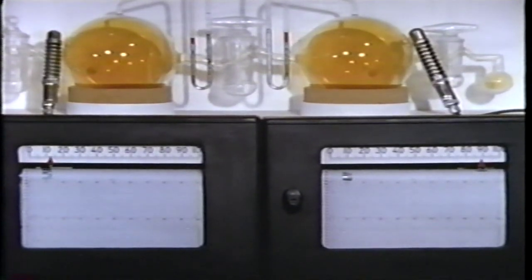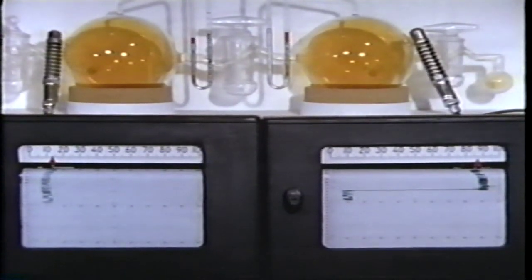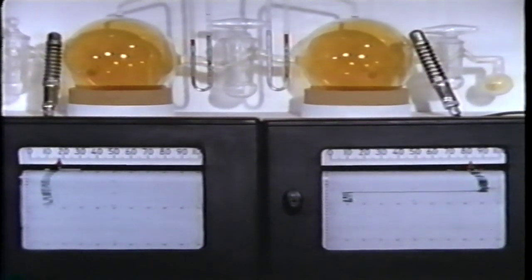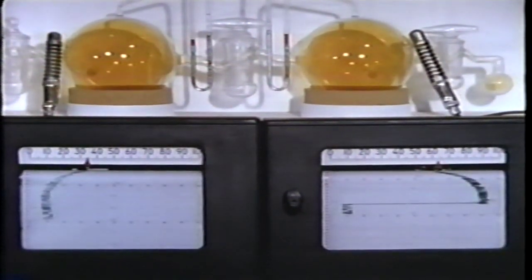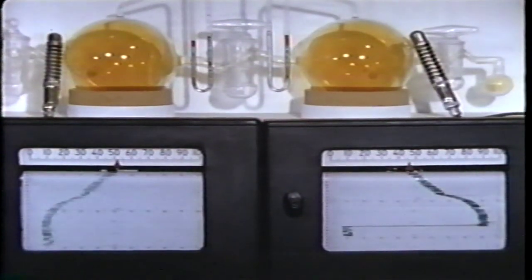Here's the chart again after 2 hours. The indicators have moved a little bit, though the pressure continues unchanged. Let's wait another 2 hours. Now there has been a substantial increase in the radioactivity in the left bulb. Though the pressure isn't changing, the radioactive bromine continues to move into the left bulb. Here it is after 2 more hours.